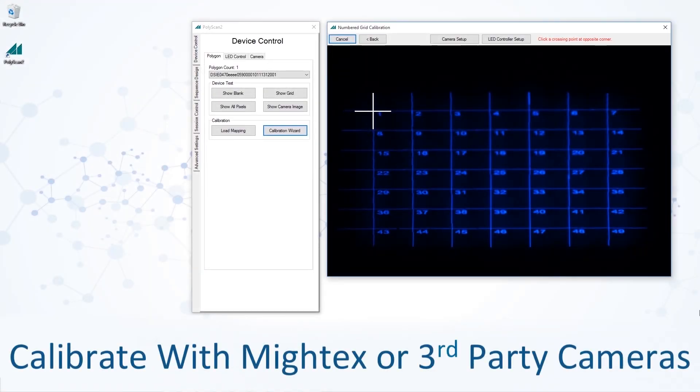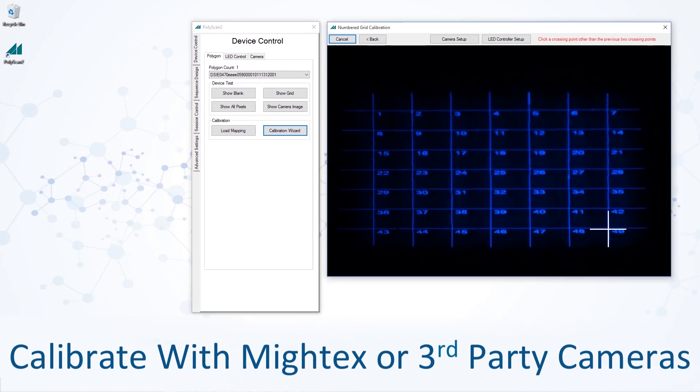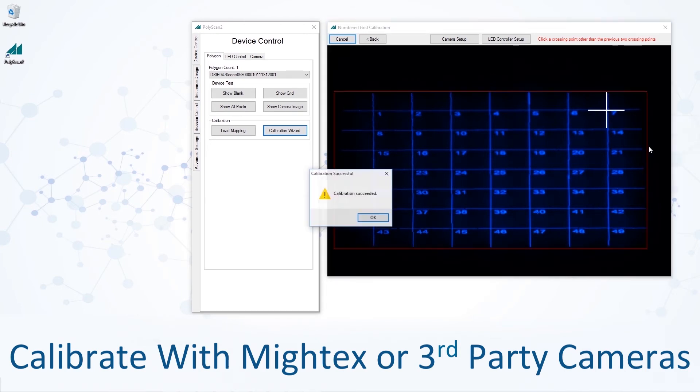In order to map the pattern illumination from the Polygon with your overall system, PolyScan features calibration tools that allow the targeted illumination capabilities of the Polygon to match the viewing area of your Mightex or third-party scientific camera. The calibration tool is easy to use and lets you get set up in no time.